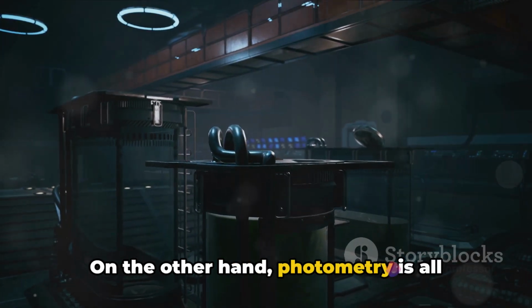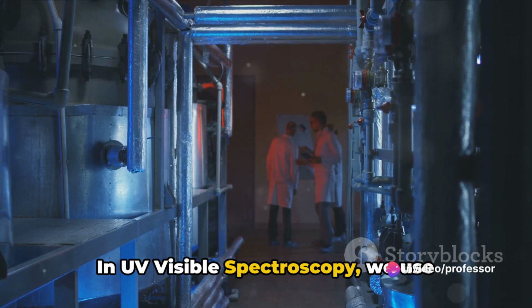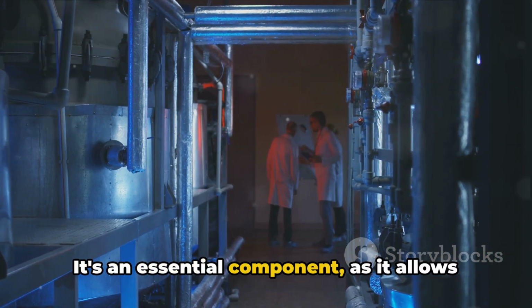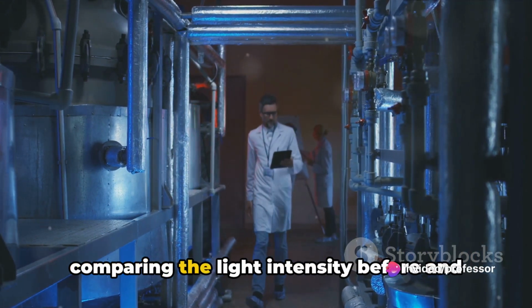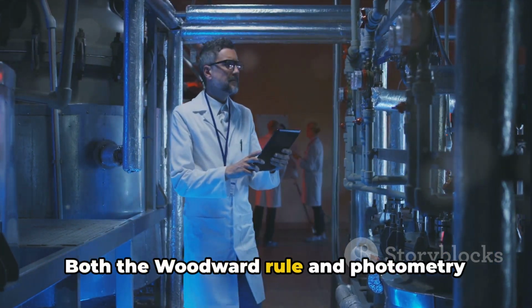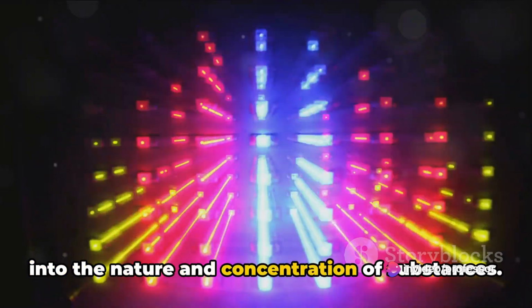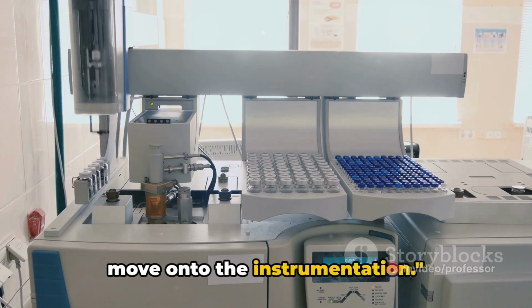On the other hand, photometry is all about the intensity of light. In UV visible spectroscopy, we use photometric measurements to quantify the amount of light absorbed or transmitted by a sample. It's an essential component, as it allows us to determine the concentration of a particular component in a sample by comparing the light intensity before and after it passes through the sample. Both the Woodward rule and photometry play pivotal roles in UV visible spectroscopy, providing essential insights into the nature and concentration of substances. With these fundamentals clear, let's move on to the instrumentation.